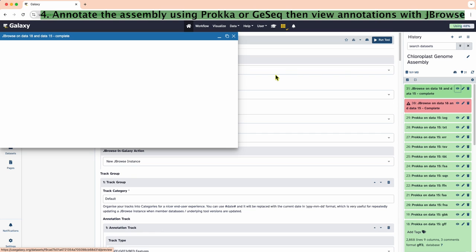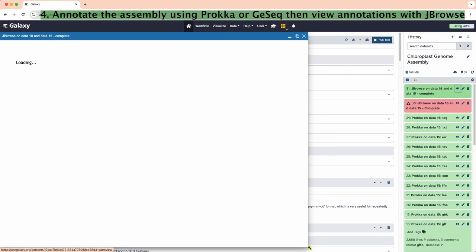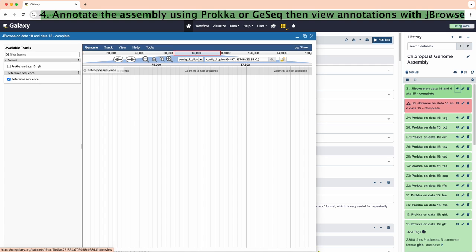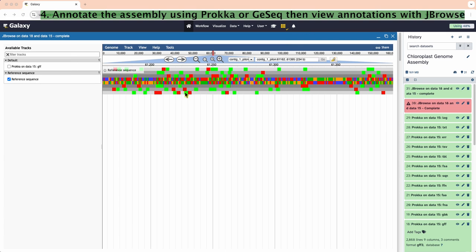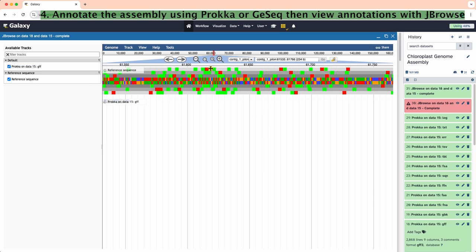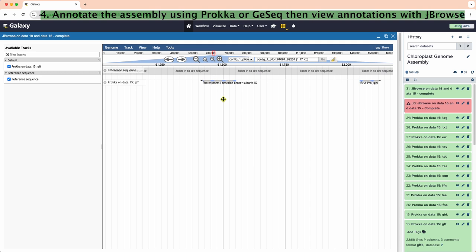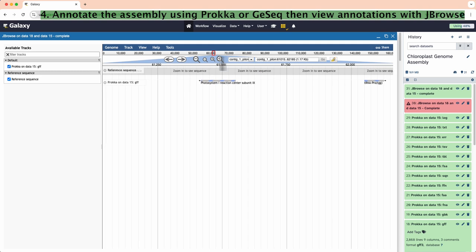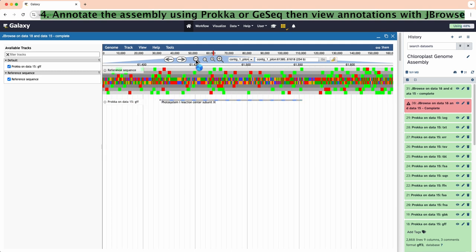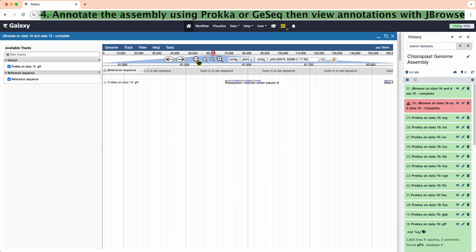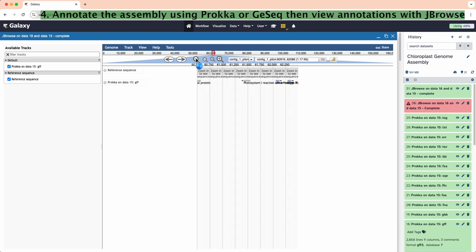Finally, view the annotation by clicking on the eyeball icon. Use the magnifying glass to zoom in and out. Check the box next to the Prokka GFF file to display the annotations. If we zoom out far enough, we will see the names of the annotated genomic features on the track.